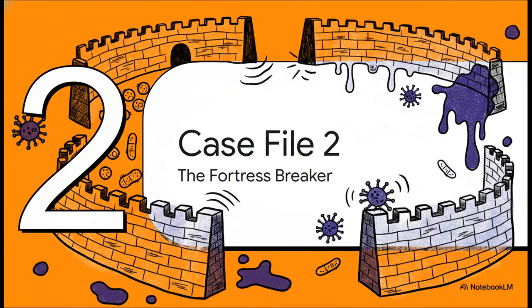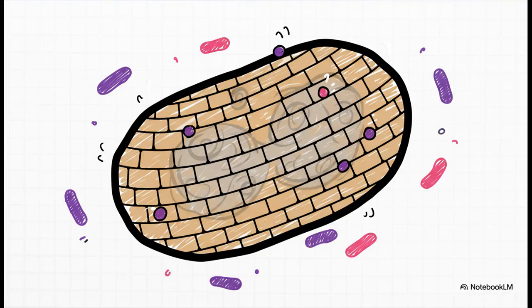Okay, on to our next case. Now, some criminals, they just have better defenses. They're way harder to find, harder to identify, and they don't respond to the usual techniques. This case involves one of the most notorious pathogens out there. Yeah, we're talking about Mycobacterium tuberculosis, the bacteria that causes TB. Its secret weapon is this waxy outer layer that acts like a fortress. It completely resists the dyes that we use in the Gram stain, so it's basically a ghost in the system. We're going to need a specialized tool to unmask this one.